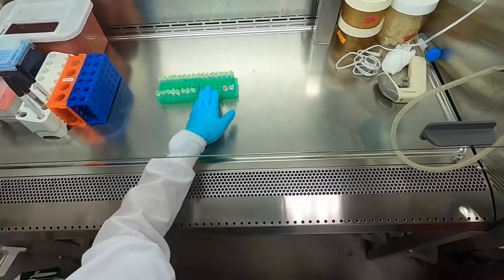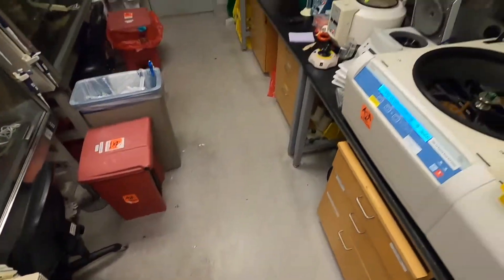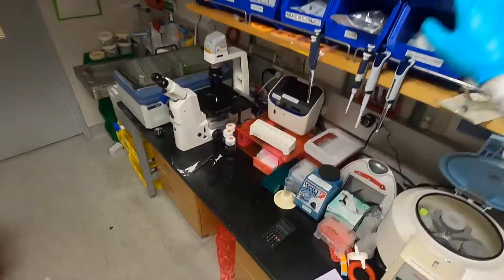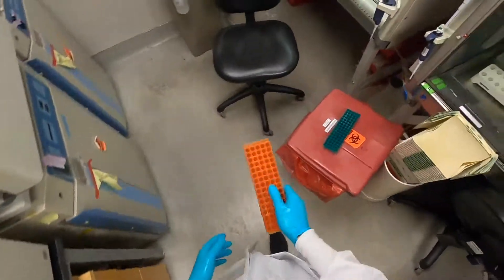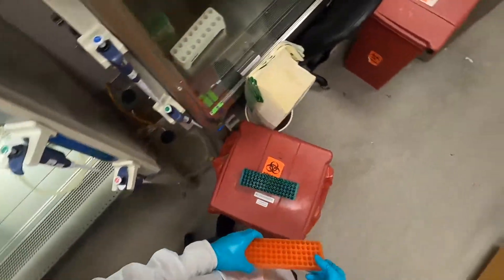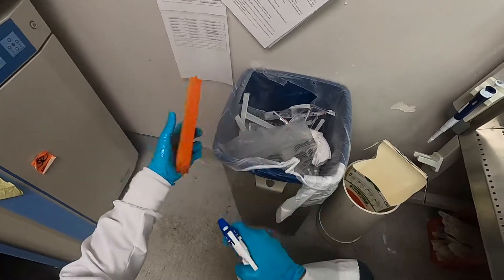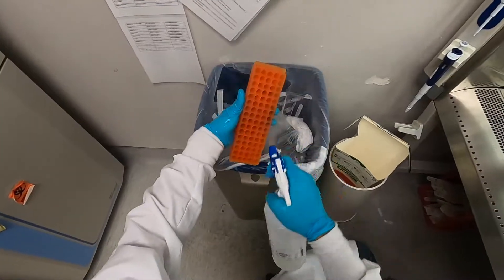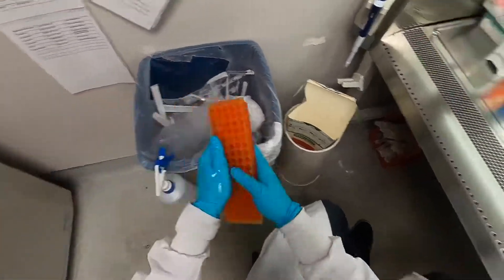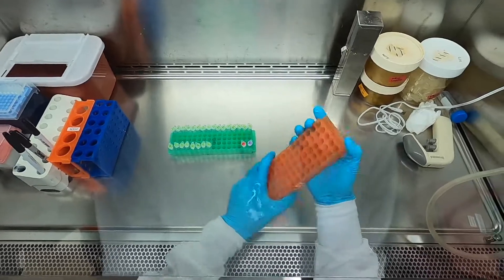I'm going to grab another tube rack because I have a lot of plasmids to transfect today. I'm going to grab one of these tube racks that lives in the TC room, because the tube rack I brought from outside has seen a lot of E. coli and other things. Hopefully this rack is more sterile, but still I'm being very precautious and spraying it down with ethanol very generously.